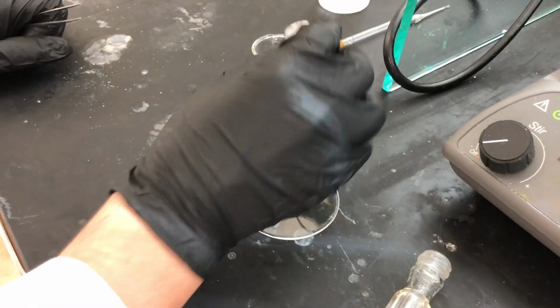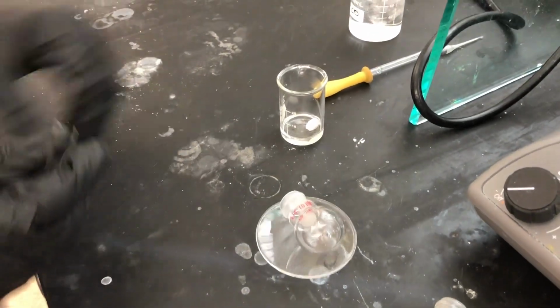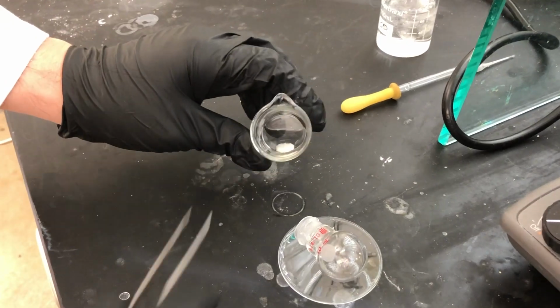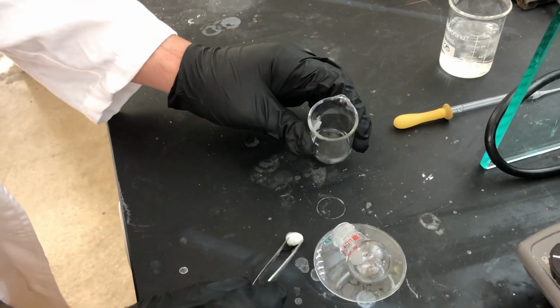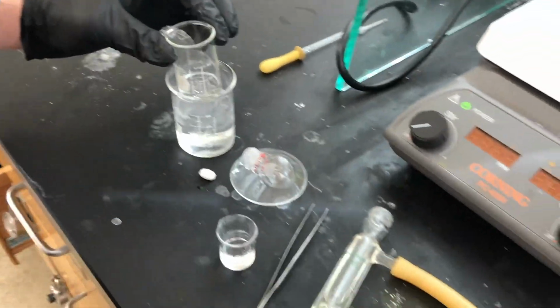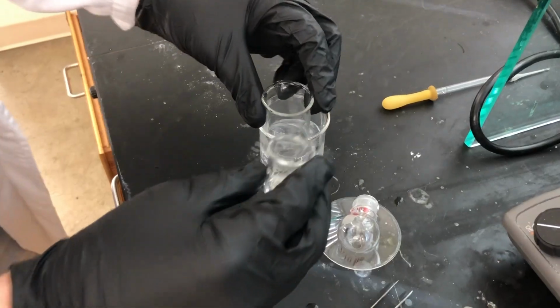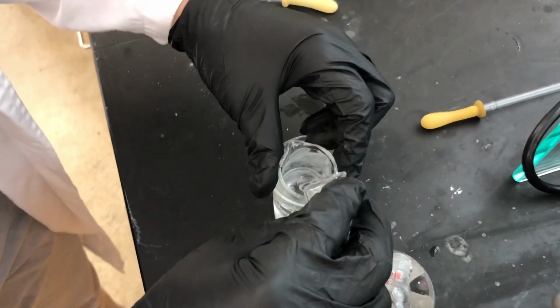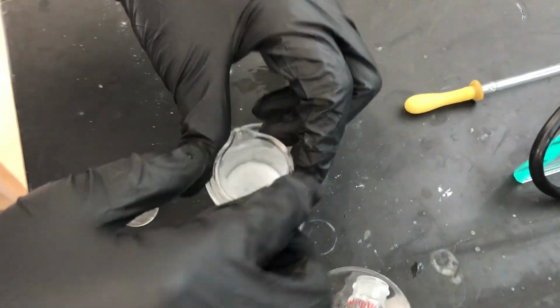It reached room temperature. I just put it into the beaker right here. We're going to take out the spin bar. And now we're going to add HCl while in an ice bath. So this is 3 molar HCl. Okay, we're going to add a couple more drops of HCl here. It should precipitate like that.